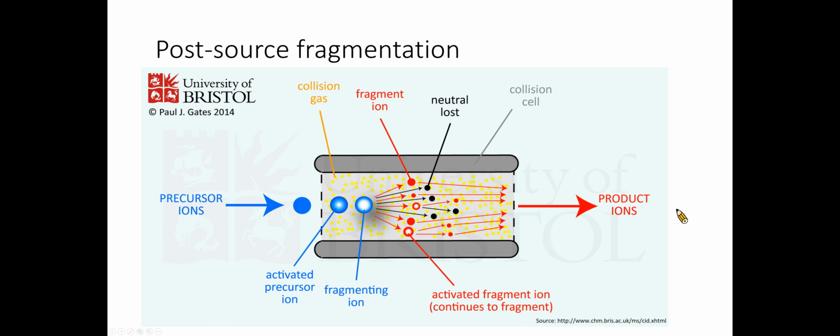Energy can also be added to the ions, which are usually already excited, through post-source collisions with neutral atoms or molecules, the absorption of radiation, or the transfer or capture of an electron by a multi-charged ion. Collision-induced dissociation (CID) involves the collision of an ion with a neutral atom or molecule in the gas phase and subsequent dissociation of the ion.